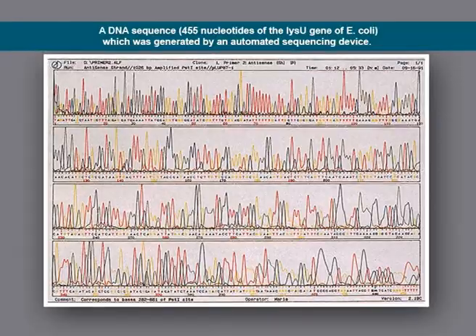At the end of the incubation period, the fragments are separated by length from longest to shortest. The resolution is so good that a difference of 1 nucleotide is enough to separate that strand from the next shorter and next longer strand. Each of the 4 dideoxynucleotides fluoresces a different color when illuminated by a laser beam, and an automatic scanner provides a printout of the sequence.